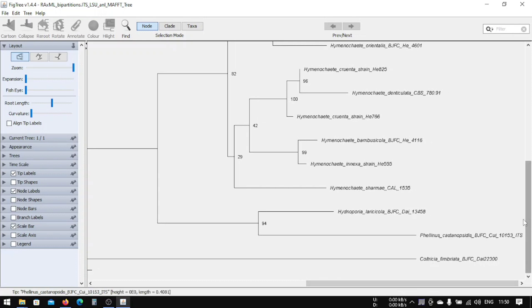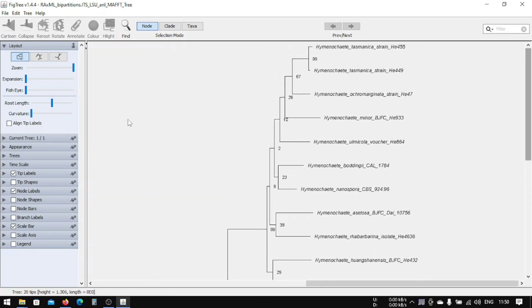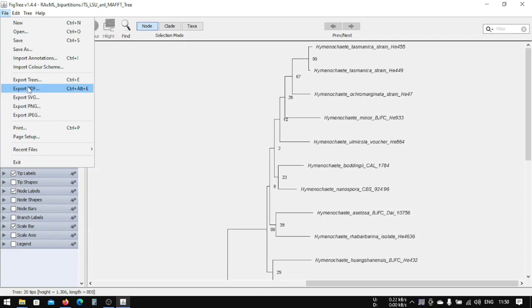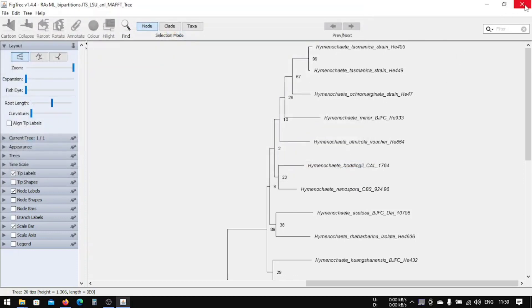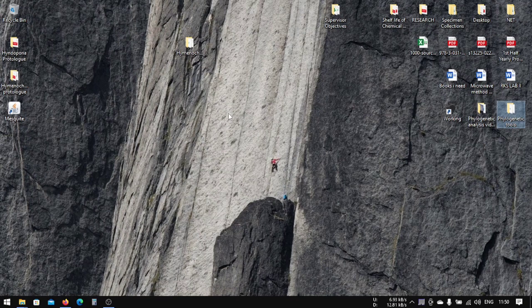This is the tree that has been generated. You can see that one group is more closely related and clusters toward the other clade. Now we can save this tree by exporting it — go to export as PDF, SVG, or PNG, whatever you want. Export to PDF and save it as a .pdf file. We are now done with the ML analysis using RAxML.